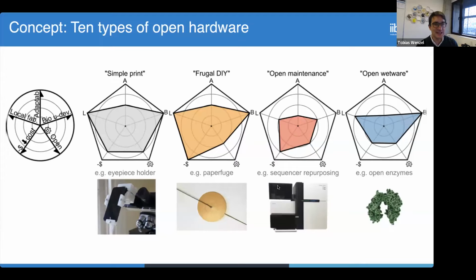Also, these are very complex devices. So often you have to make some modifications. They're very difficult to work with. They're not very user-friendly components in there. They're usually optimized for industrial fabrication. So if people share that, you can maybe replicate it, but adapting it further is usually hard. And you can't do much that's not already there.